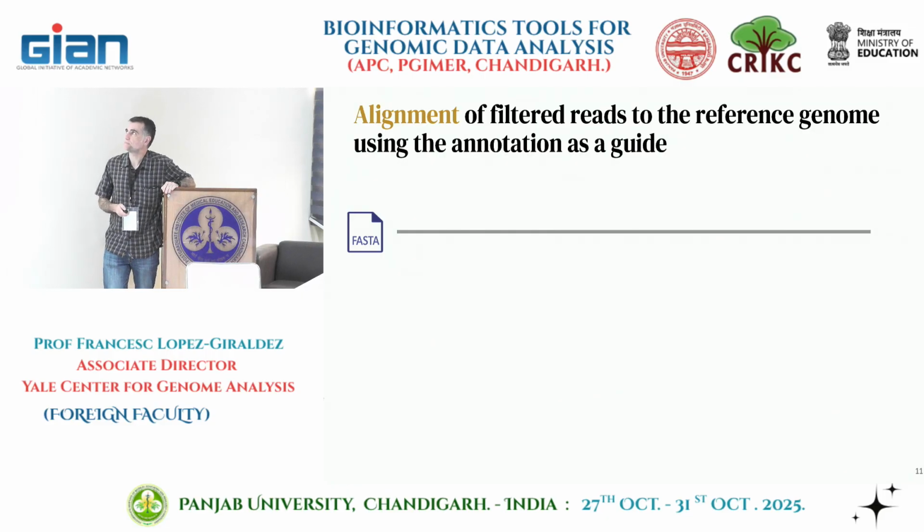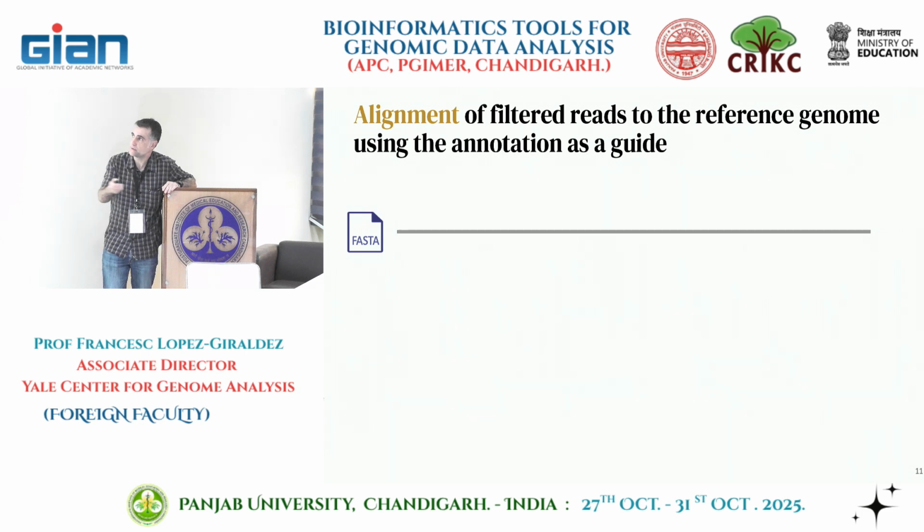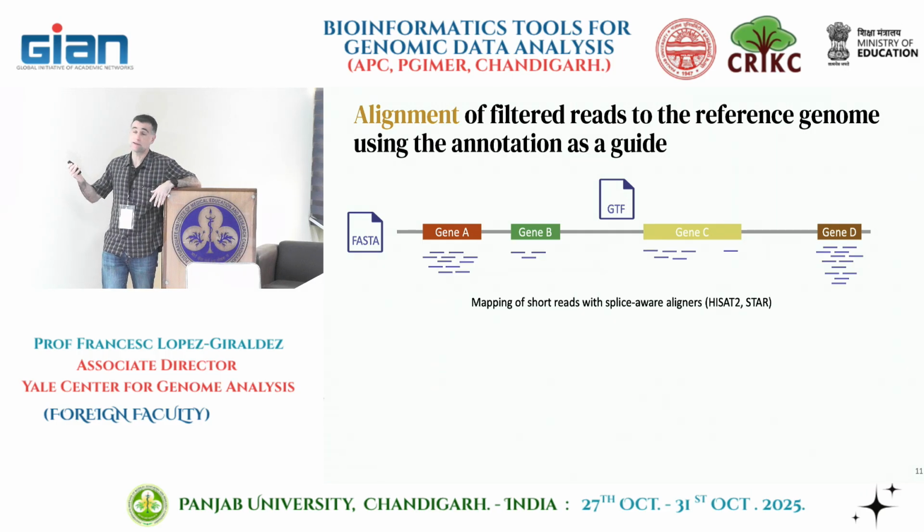Okay, the alignment. We use the genome information; that's where we're going to be aligning our reads. We have the GTF file, which tells us what is in every position on that genome. And now we need to align the reads. In this case, we're going to use the splice-aware aligner HiSat2.